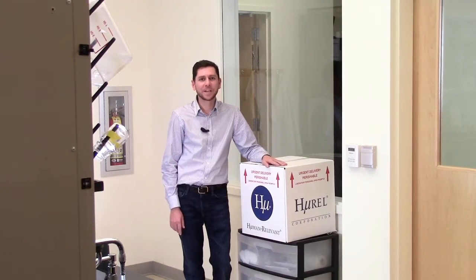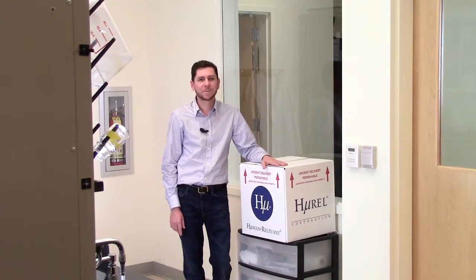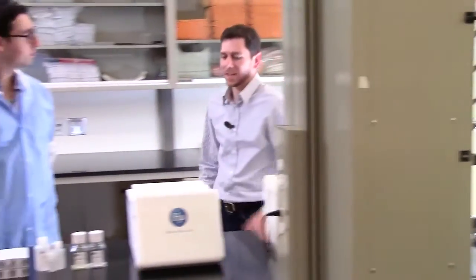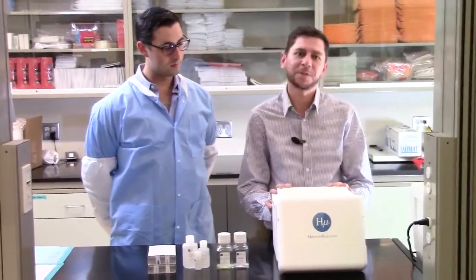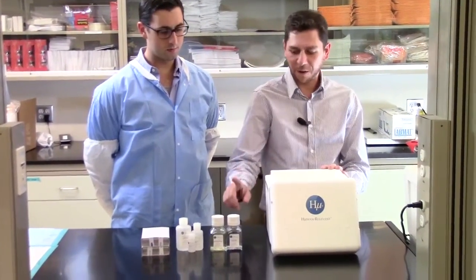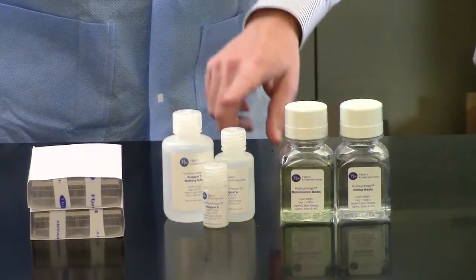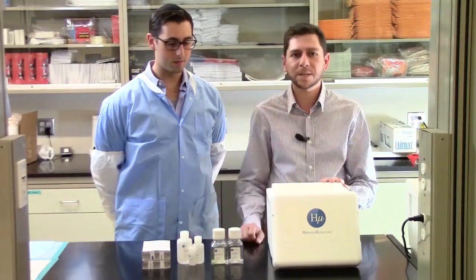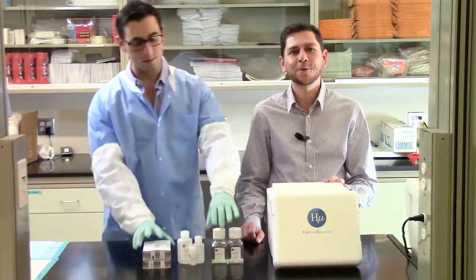Here's what you'll find waiting for you when you get in in the morning. This box is the one that travels from our labs by courier to yours. When you start to unpack this box, you'll find inside a smaller box which has everything you'll need for our kit. First we have our dosing media and our maintenance media, and three reagent bottles that we're going to use in our assay.